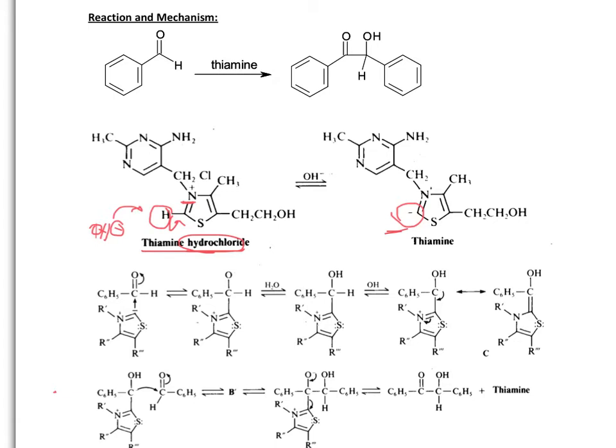That will be the generation of this negatively charged nucleophilic carbon, which is going to be used with the 4 milliliters of benzaldehyde. As you add the sodium hydroxide, that yellow color gets generated only for a split second.